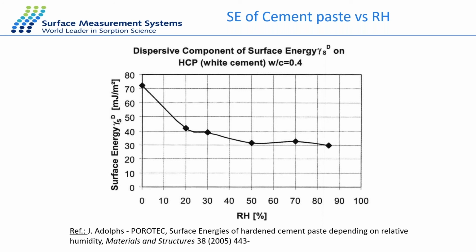Sometimes there's just a slight difference along the relative humidity. Here, you can see the surface energy drop significantly at the very, very small relative humidity.